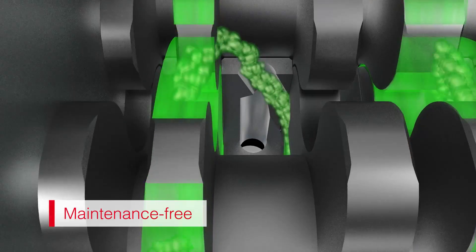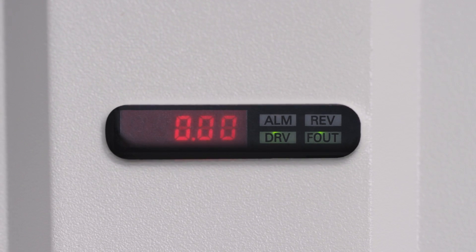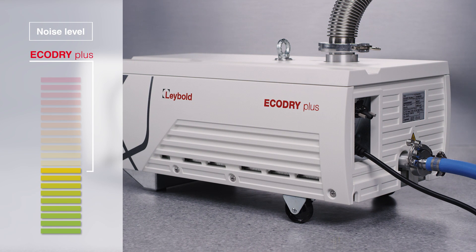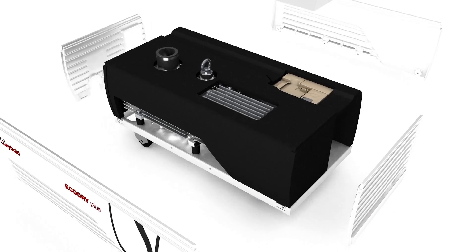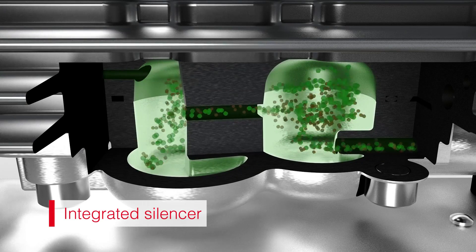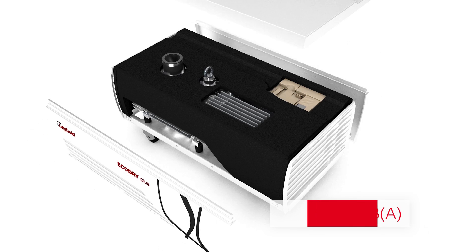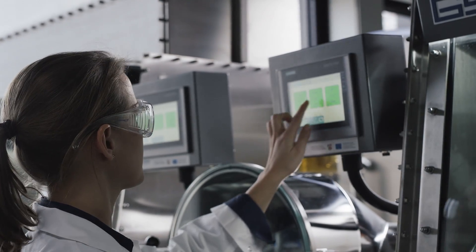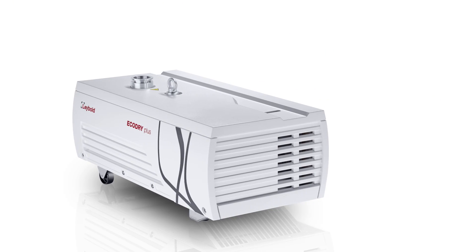With the eco dry plus you always have everything under control — the integrated display keeps you up to date on the pump status at all times. Once switched on, you'll notice its comparably low noise level. At Leybold, every effort has been made to reduce noise emissions from each component. The motor and rotors run exceptionally smooth, a silencer integrated in the exhaust ensures quiet gas discharge even at higher operating pressures, and acoustic insulation in the pump housing reduces noise even further. At just 52 decibels, the eco dry plus is less than half as loud as other pumps. Let's turn workplaces into quieter spaces with the new eco dry plus.